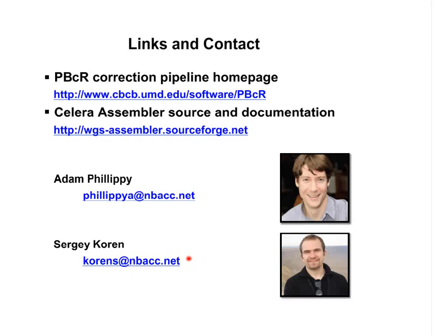So, okay, back to the top. We've got some more general background clarification questions, and then some more specific technical questions for people who are actually trying to put this approach into practice. So some different degrees of difficulty, but let's just go through them. Some basic questions, Adam, firstly, just so we all know what we're talking about: what are you seeing as the typical PacBio error rate? Can you talk about the distribution of those errors? Are they random, or is there an error profile? And perhaps you can just quickly clarify what is the read length distribution that you're seeing on the PacBio sequencer.